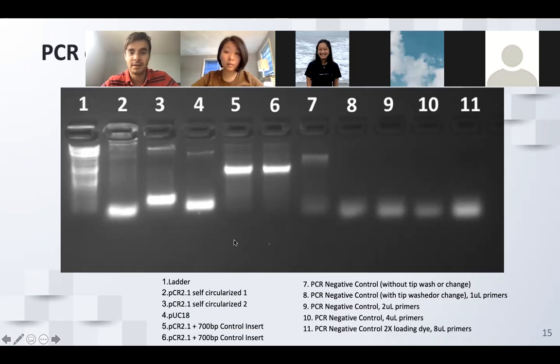In the gel electrophoresis, we applied an electric field that caused the DNA to migrate, and then we were able to detect our amplicon.